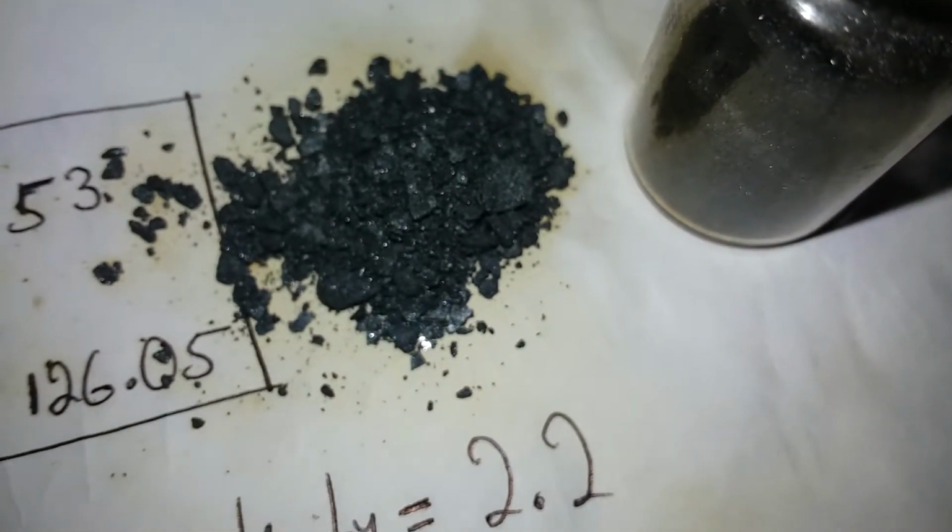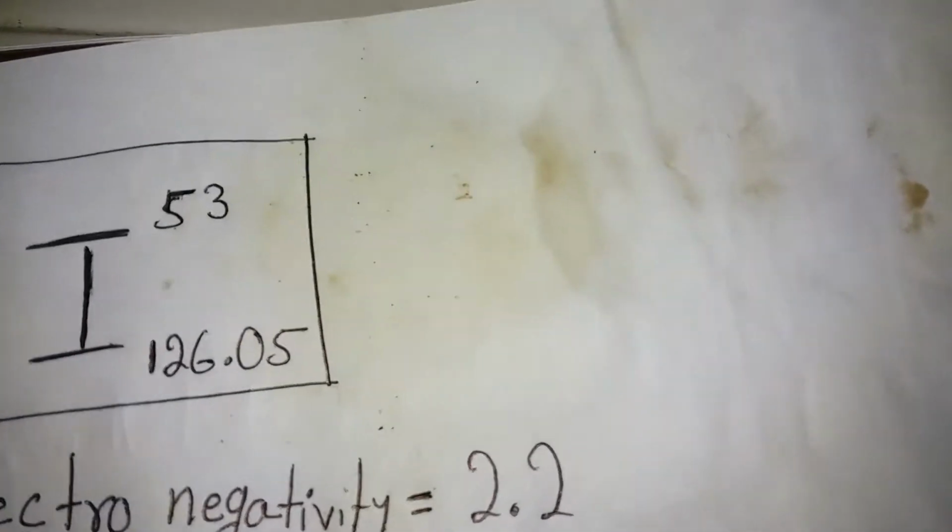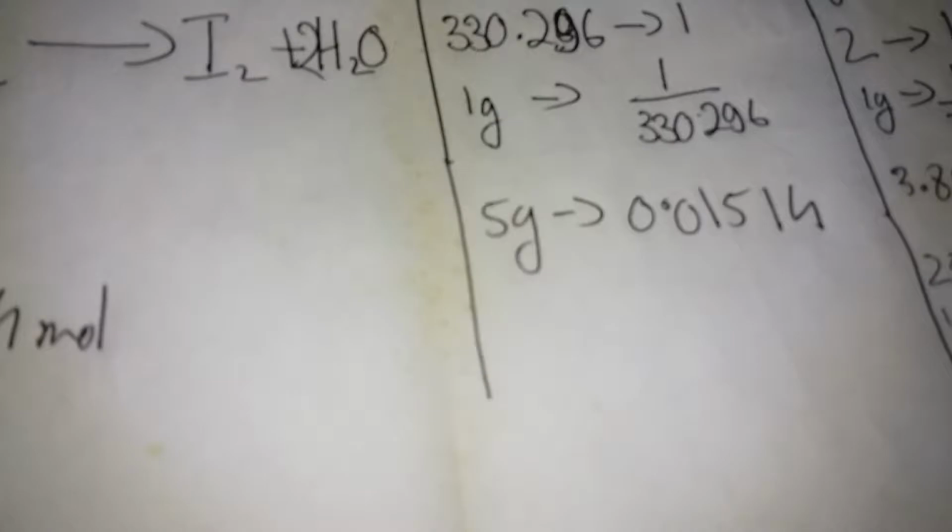Okay, let me put all this back. Now, as you can see, the iodine just stained almost everything from here and down to here.